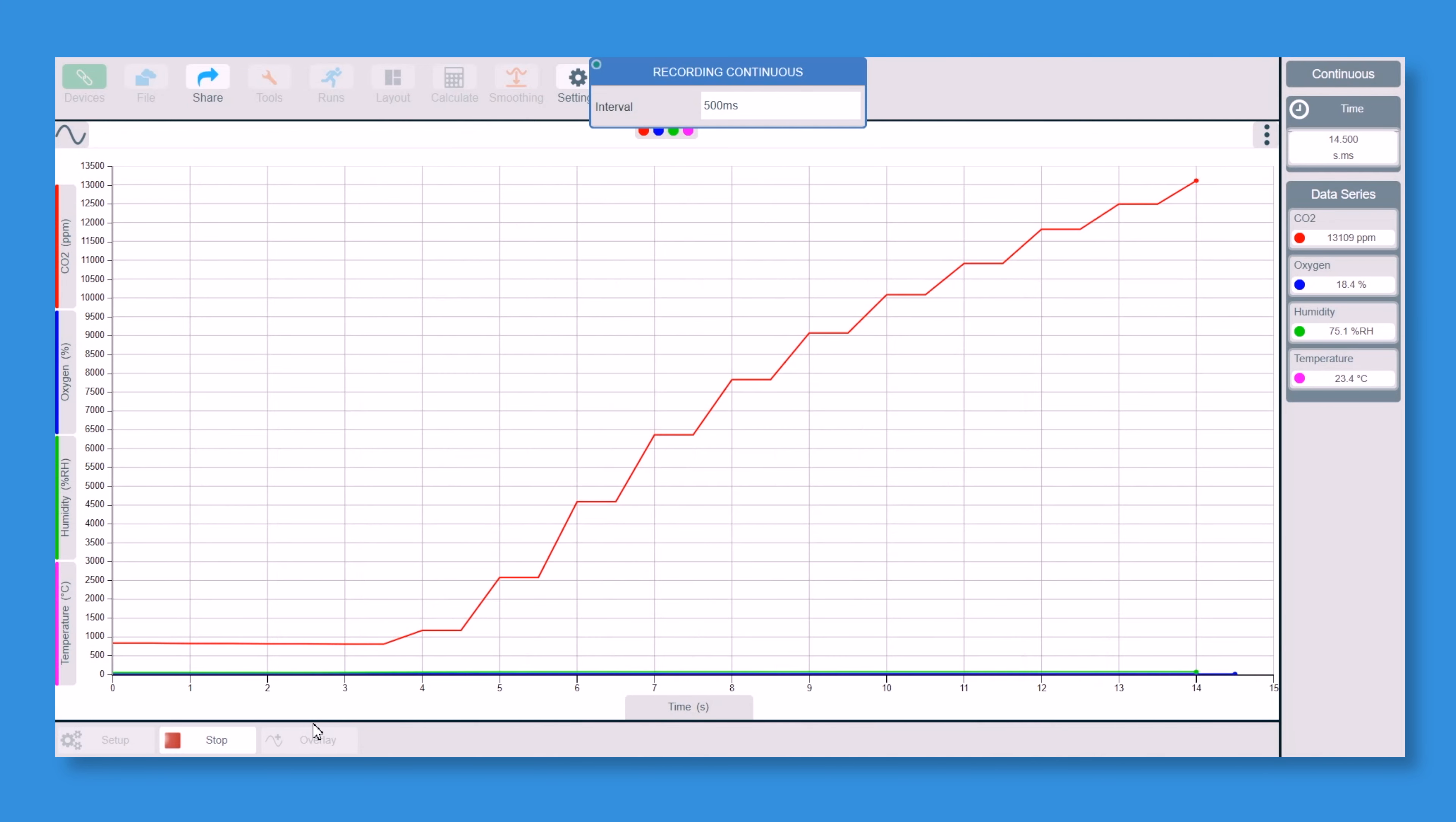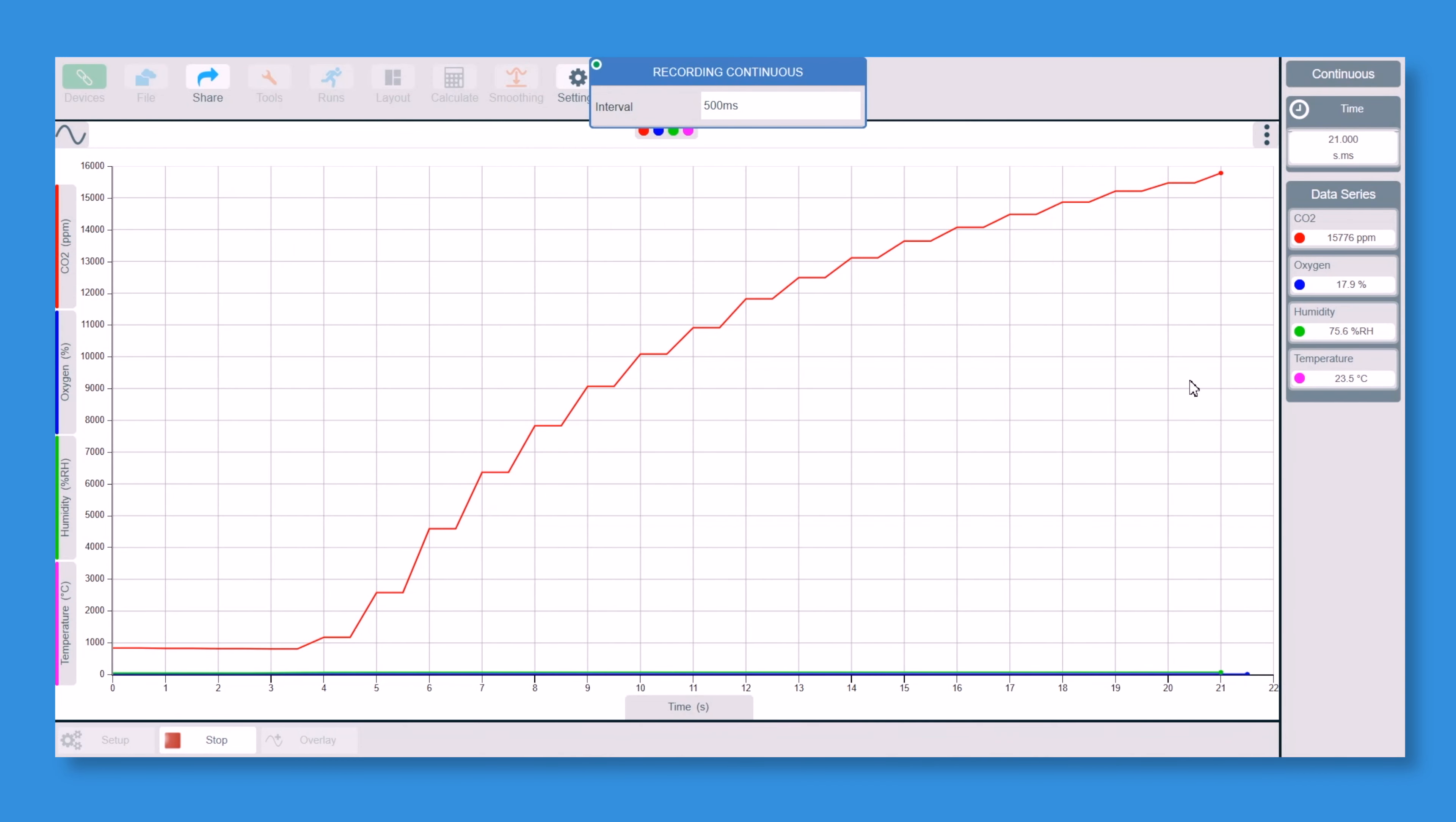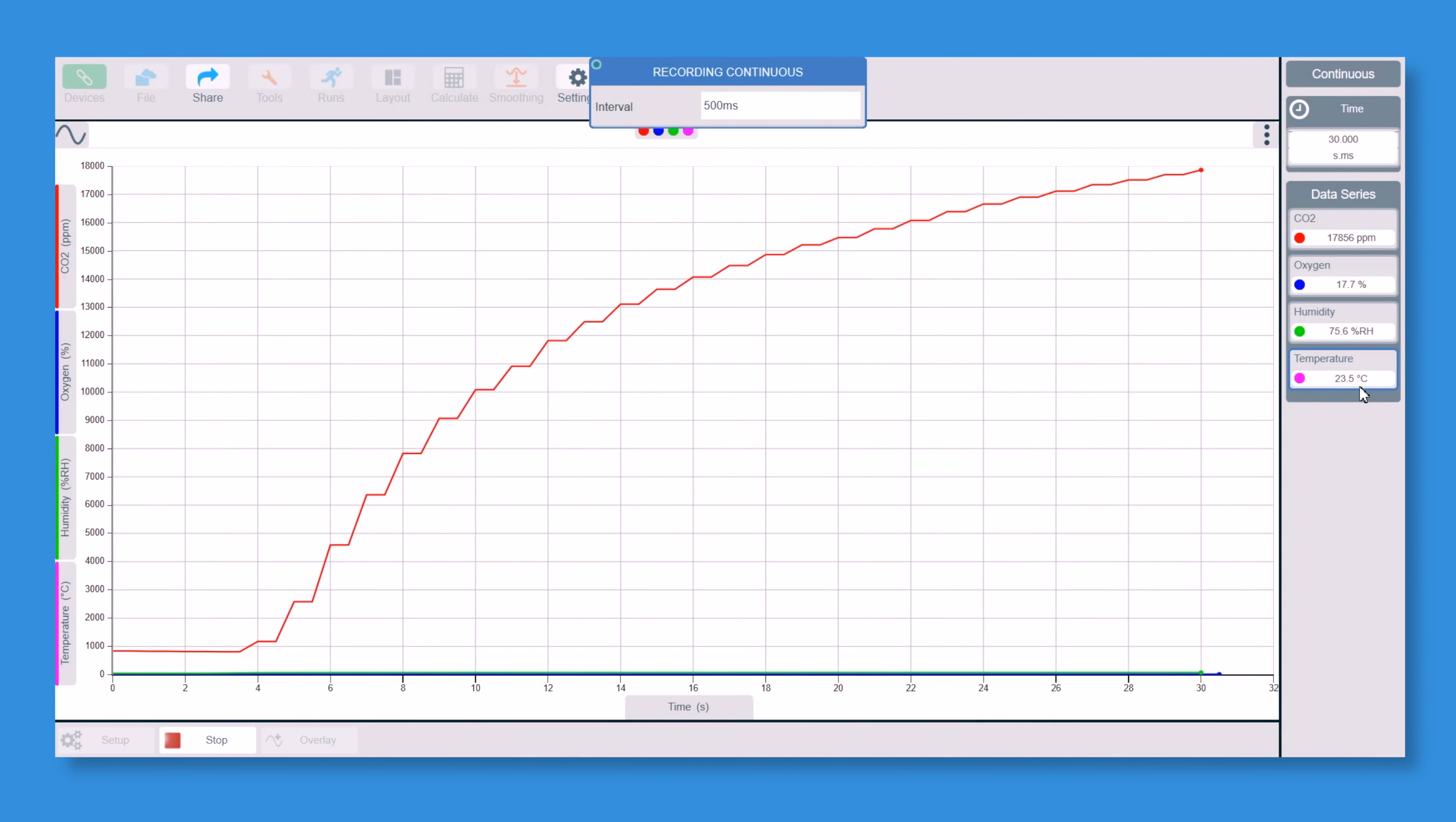So this is when we have to wait a few more seconds, maybe 30 seconds, as long as you want really. But you can see on the right hand side here, O2 is also dropping, oxygen. So CO2 is at the moment at 16,000 parts per million, O2 is at 17.8, humidity is at 75 and temperature is at 23.5.